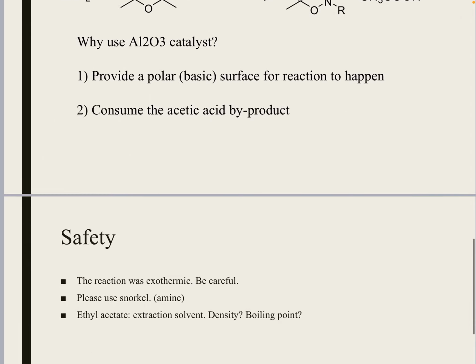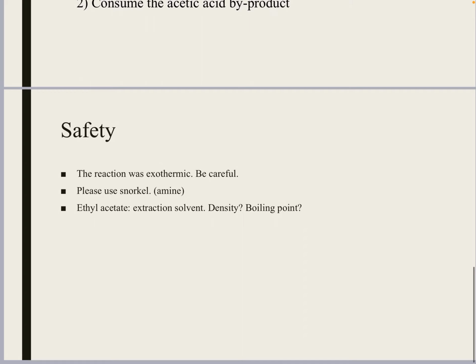Right. And last but not the least, safety. Firstly, the reaction was exothermic. And you will see what I mean when you're running the reaction yourself. You can hear the popping sound. You can sometimes see the liquid jumping around and splash around. So be very careful when you're adding your reagent in a drop-wise manner, okay?